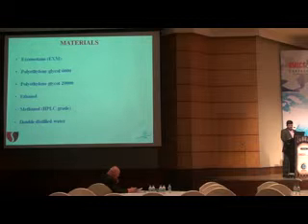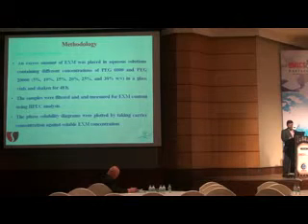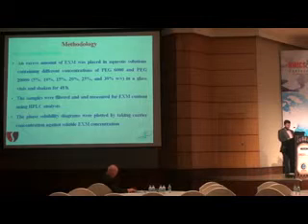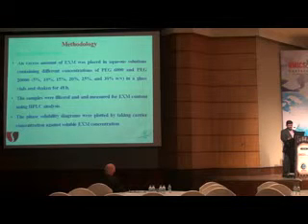So the materials, as I said, involve exemestane, the active ingredient, and polyethylene glycol 6000 and 20,000 and other solvents. So the methodology includes first conducting the phase solubility studies to understand, out of the two carriers, PEG 6000 and PEG 20,000, which has a better solubility profile.